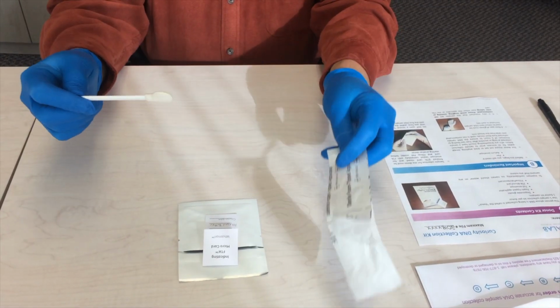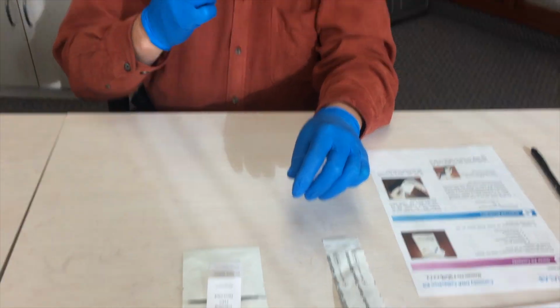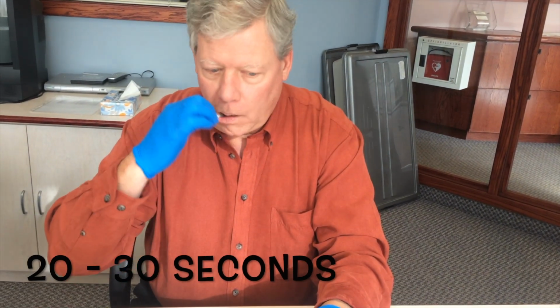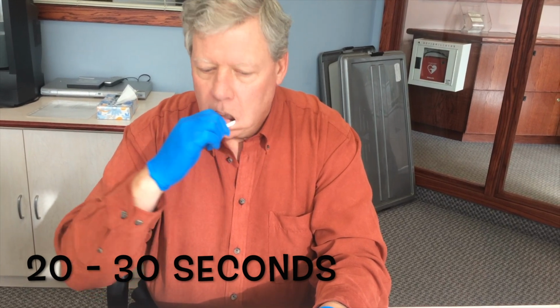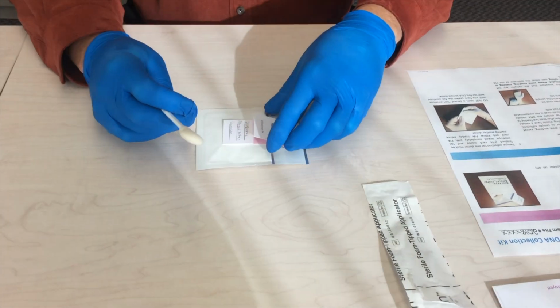Use the foam swab to rub the inside of the donor's mouth for 20 to 30 seconds. Make sure to rub both sides of the foam swab firmly against each cheek, under the tongue, and behind the lips. If you are overly gentle, you will not get enough cheek cells on the foam swab.